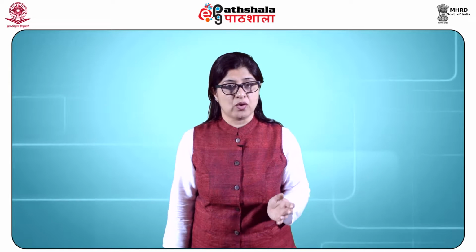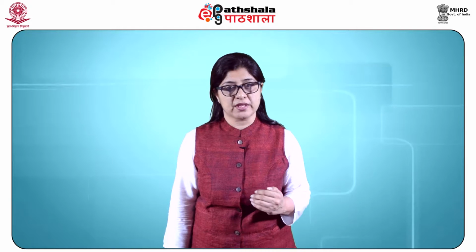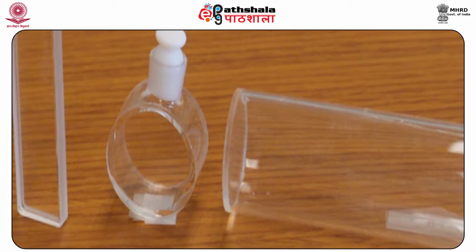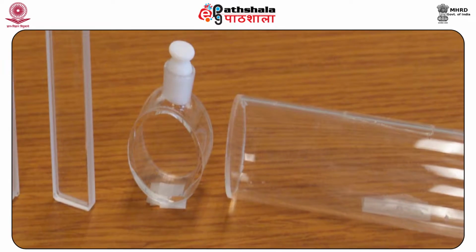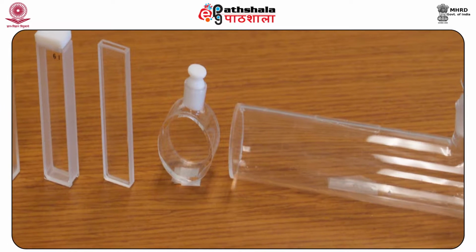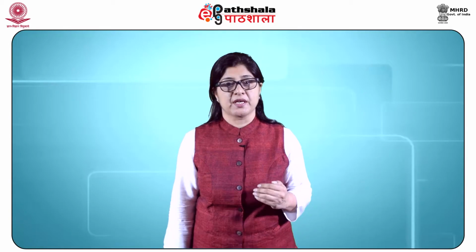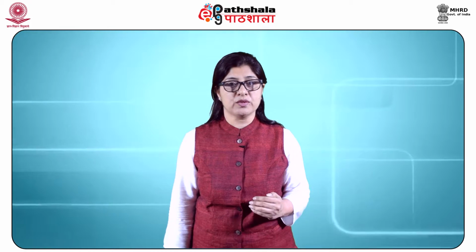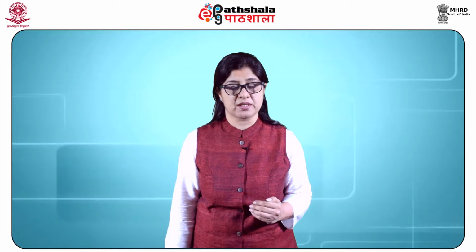A quartz cell of 1 centimeter path length is generally used for this purpose. Cells with other path lengths are also available, as shown here in the figure. Cells with larger path lengths are useful for the analysis of very dilute solutions. Glass cells cannot be used as they strongly absorb ultraviolet radiations.